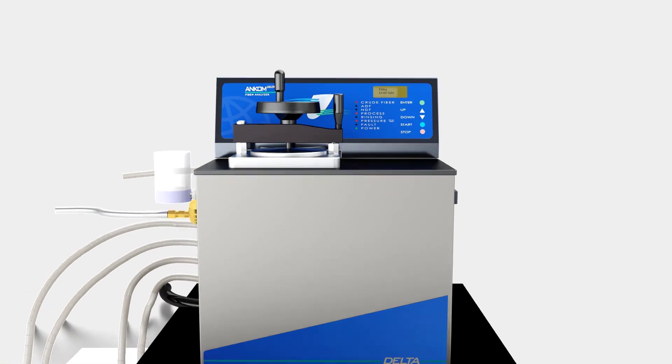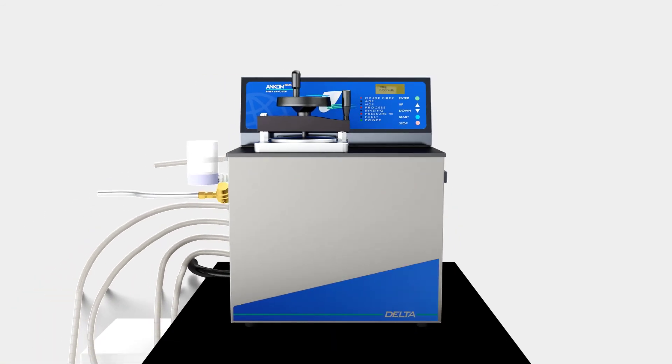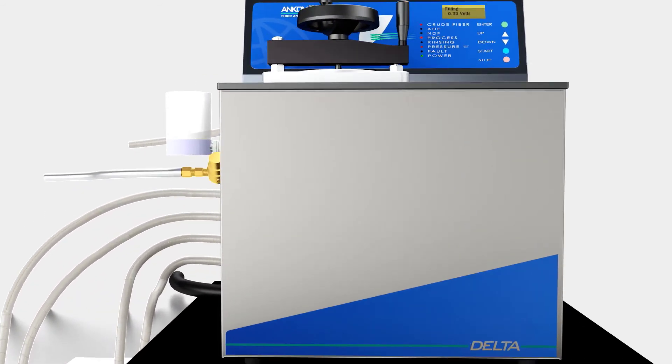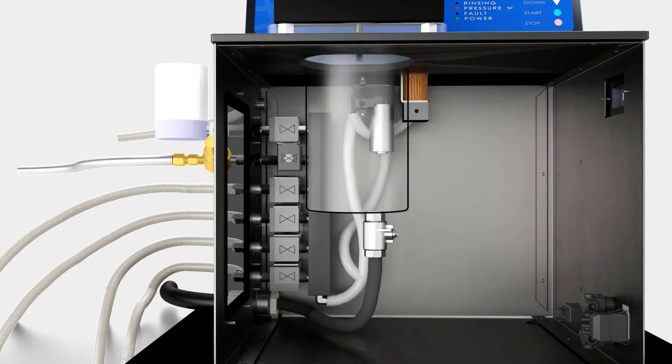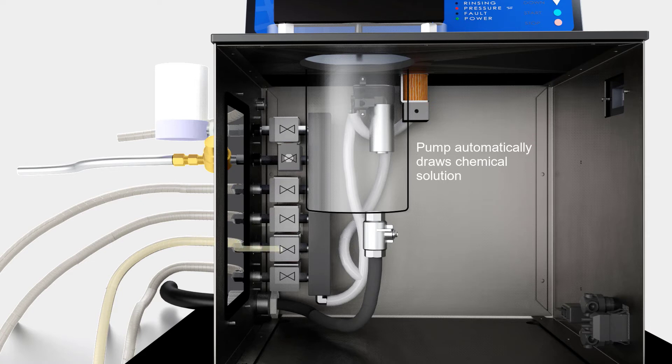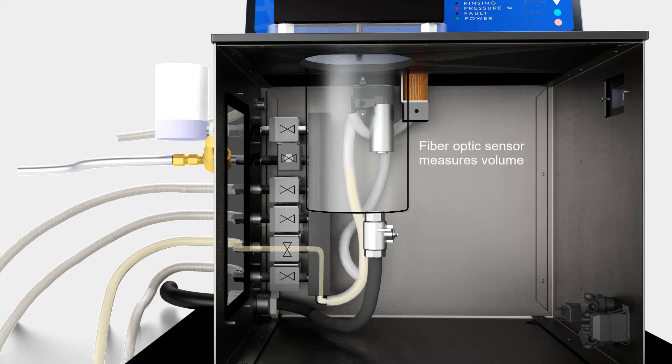The Delta's internal pump system automatically draws the appropriate chemicals in the program sequence per the selected method. One of the five solution valves opens to allow the pump to draw the required chemical. A fiber optic sensor indicates when the correct volume of solution has been delivered and the vessel is full.